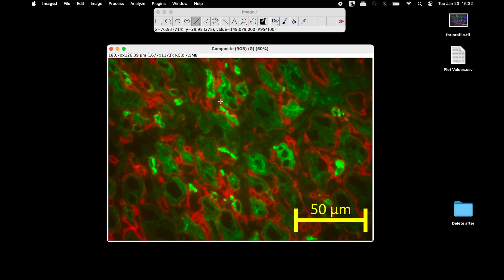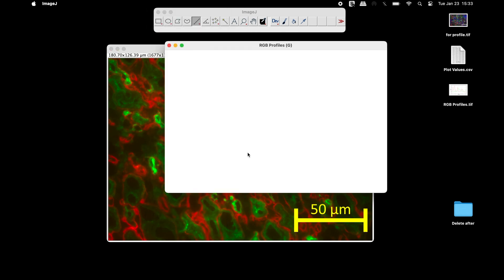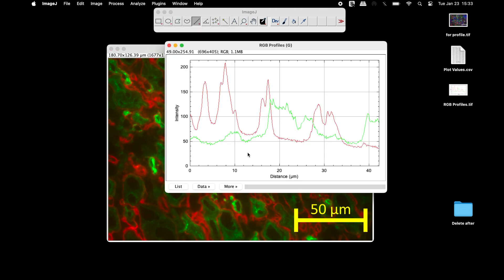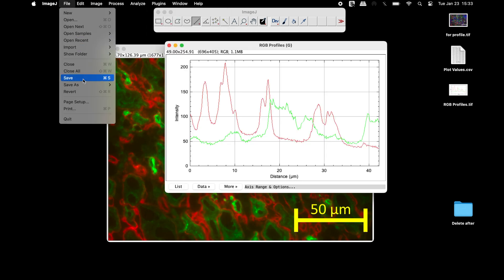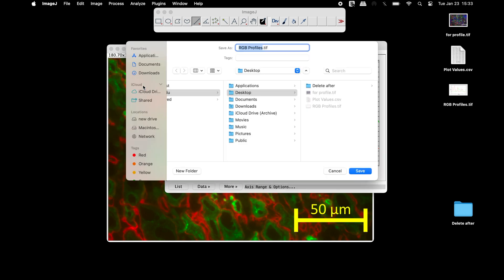Again, select the line tool from above and mark the region of interest. Use the RGB Profile Plot plugin to obtain the profile plot for the red and green channels. This profile plot can be saved in any format of your choice.